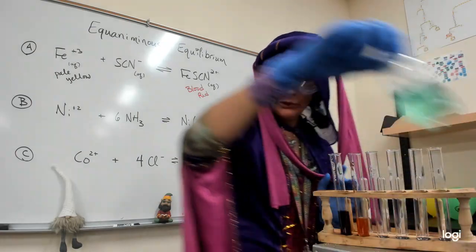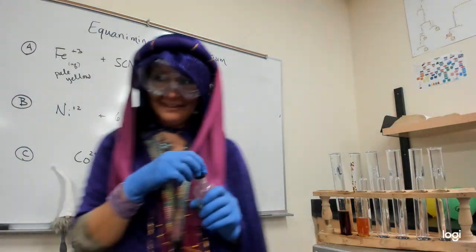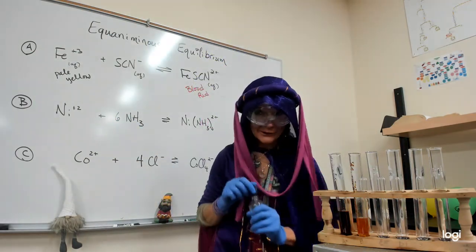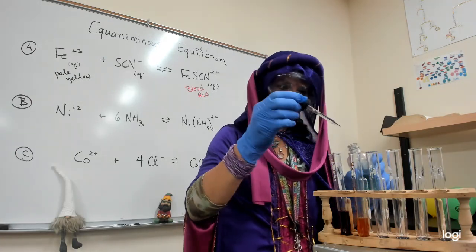All right, so now we're going to work with nickel nitrate. So, in our equilibrium, why is there no nitrate? Oh, because he's Nick. They gave me lousy droppers.